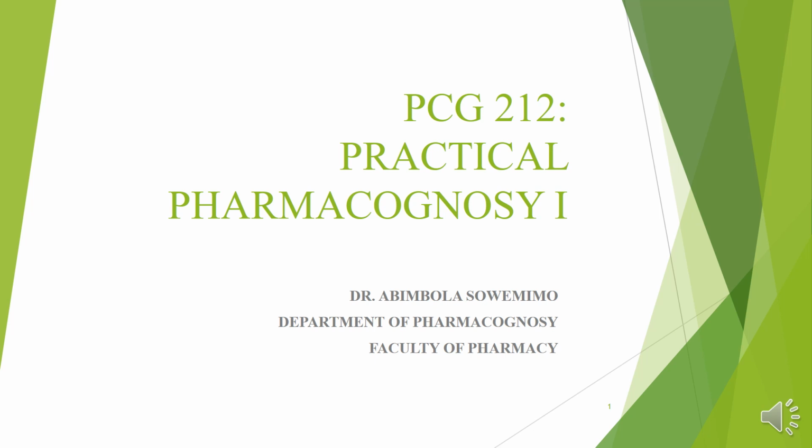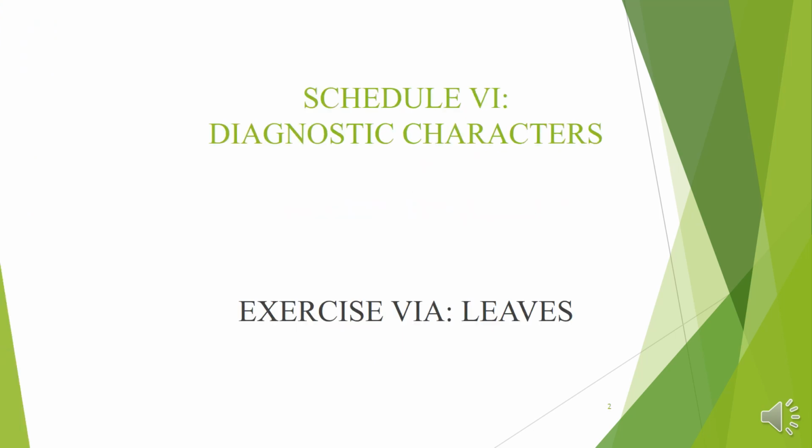You are welcome to PCG 212 Practical Pharmacognosy 1. And today we'll be looking at different diagnostic characters. So we'll be looking at Schedule 6 and examining diagnostic characters that can be found in the leaves, that's exercise 6A.